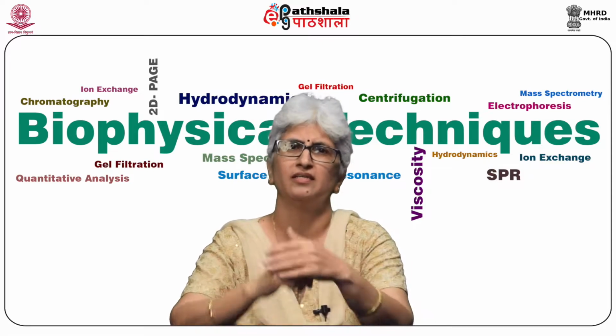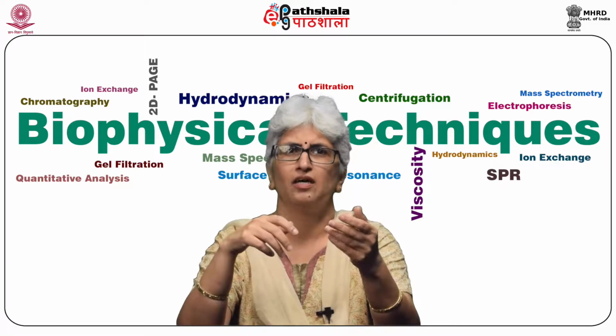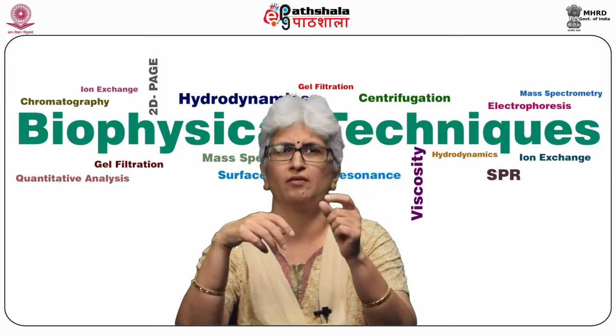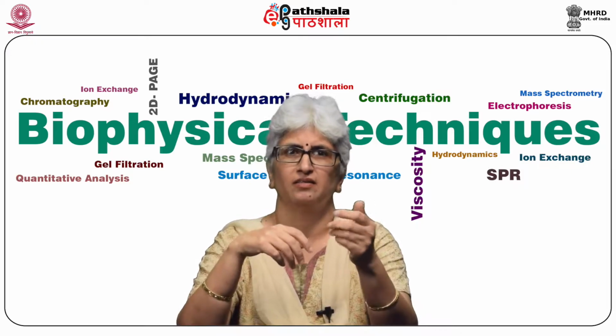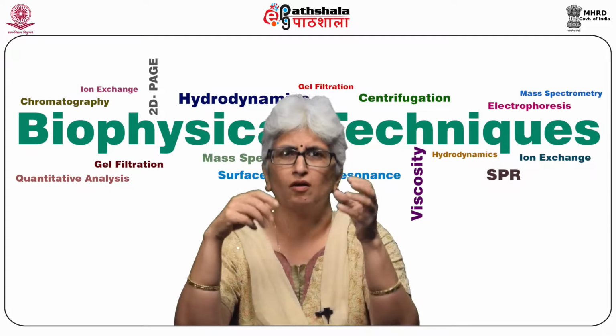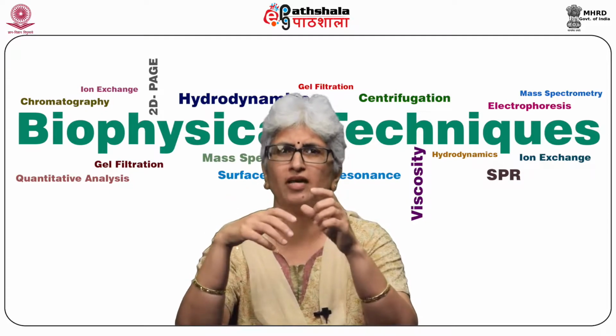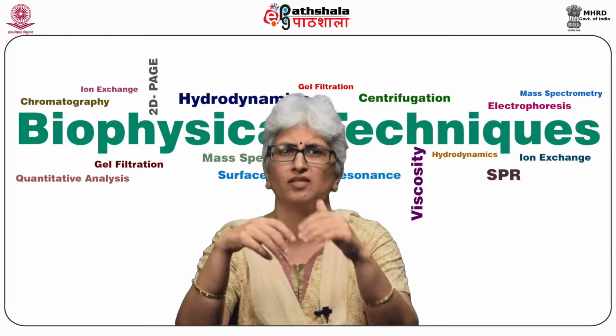Another method is affinity purification with immobilized antigens. To purify a specific antibody from a crude sample, this strategy is applied. Antibody-specific antigen is first covalently immobilized on a solid support matrix, and then the crude sample is passed through it.